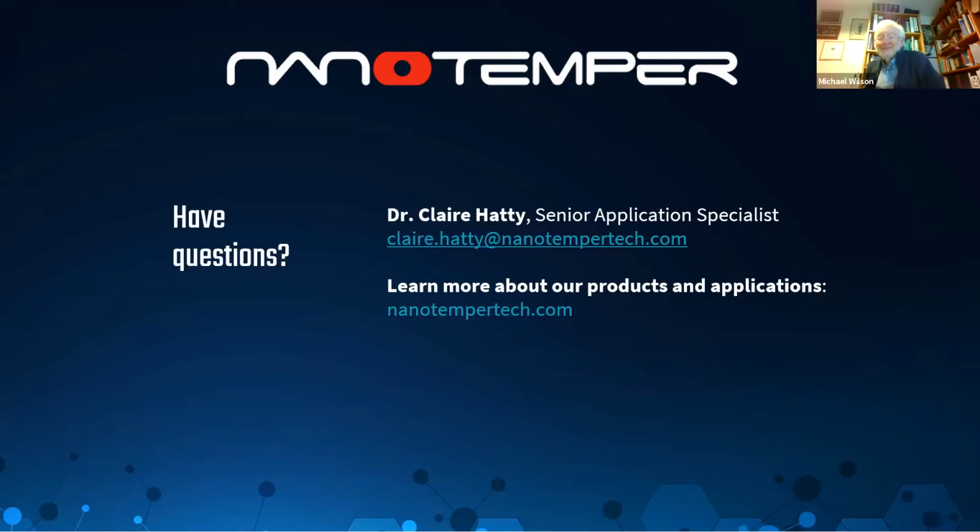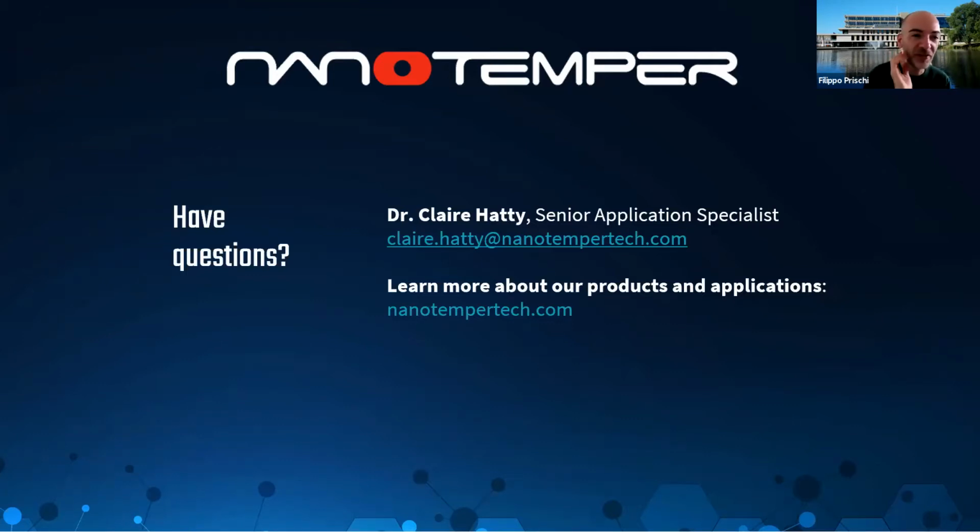Okay, thank you. And probably linked to that, I remember back in the days, I actually tried to do it once, but never managed. Stoichiometry. I remember it's possible. It's not that straightforward though, because that's the main thing that you get from ITC, but yes. So it is possible.